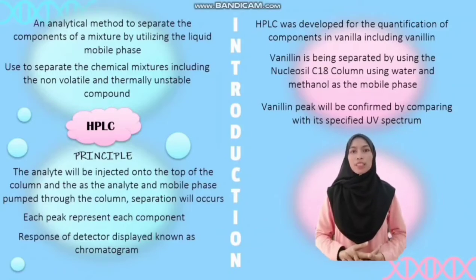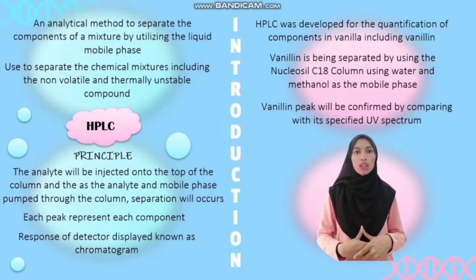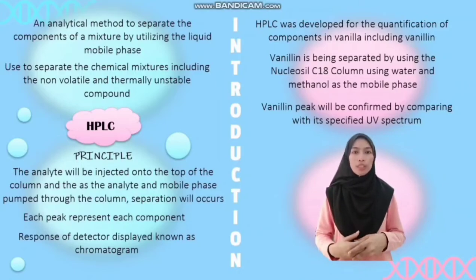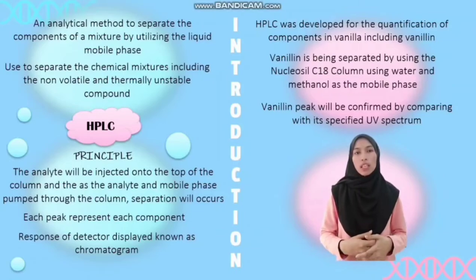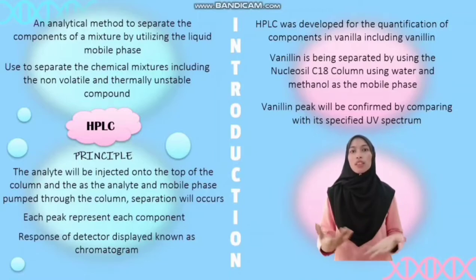For your information, HPLC has been developed over the past 20 years, focusing on the quantification of components in vanilla, not only vanillin but also other components. This study's purpose is to determine vanillin in the ethyl alcohol extract by using the HPLC technique.